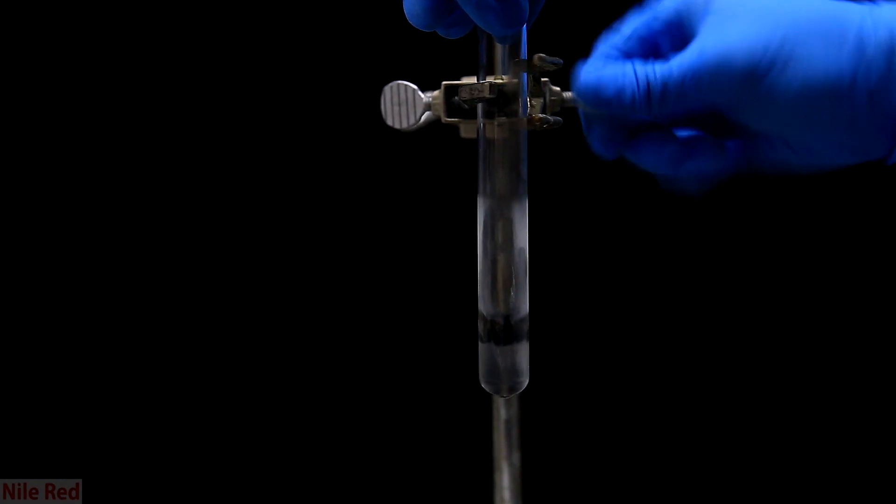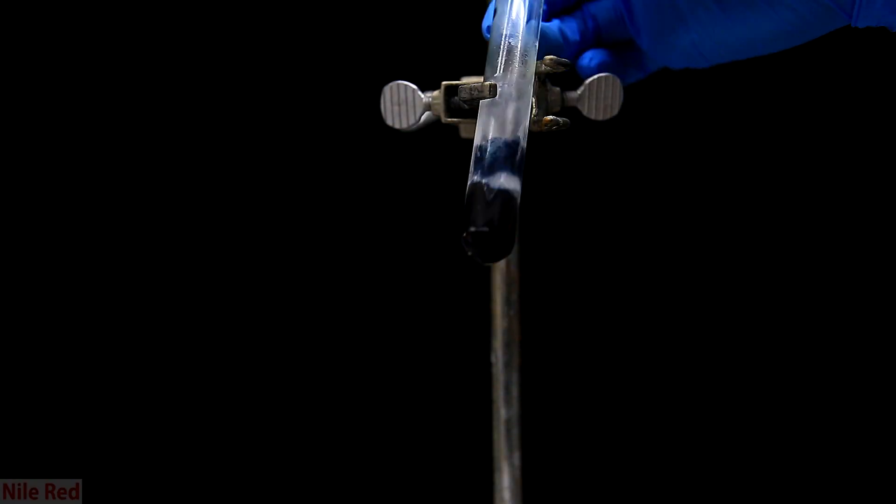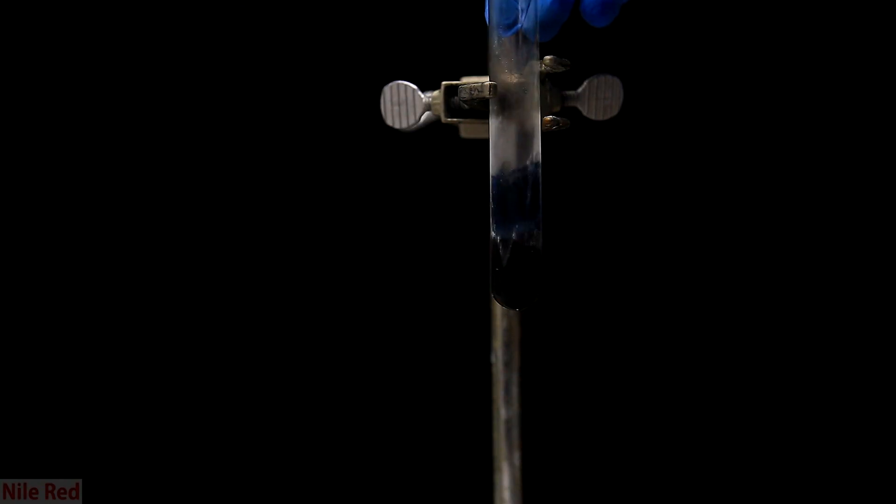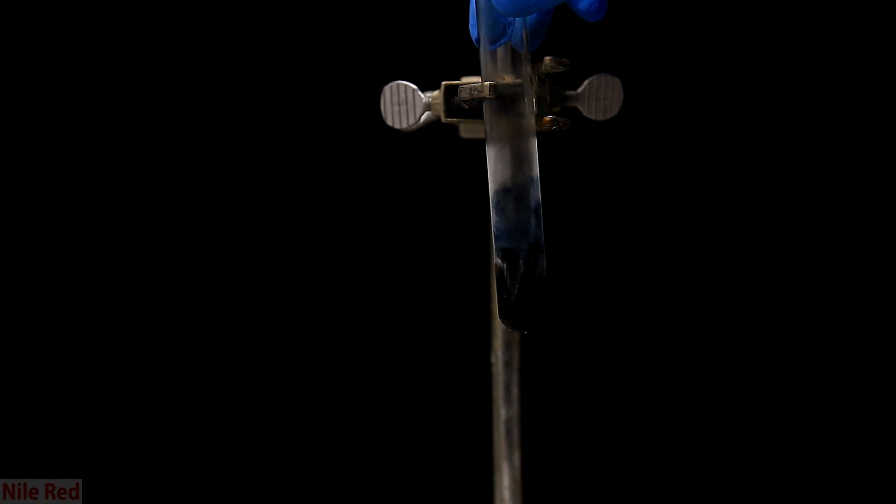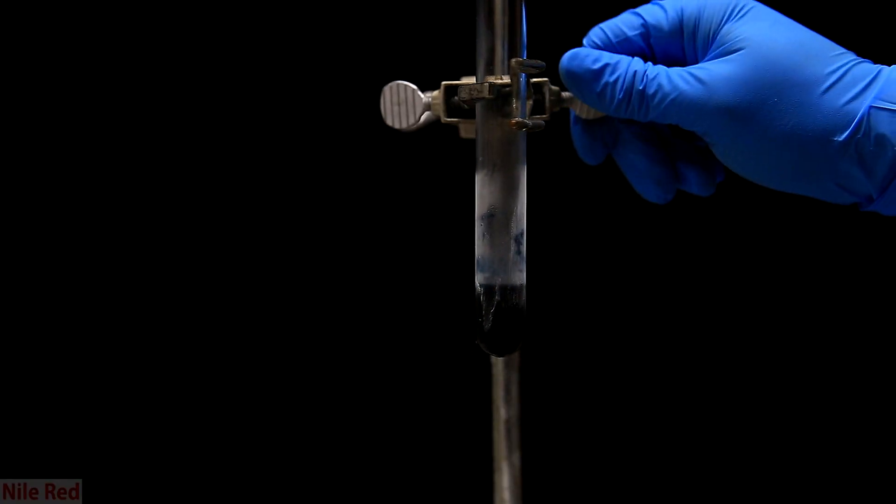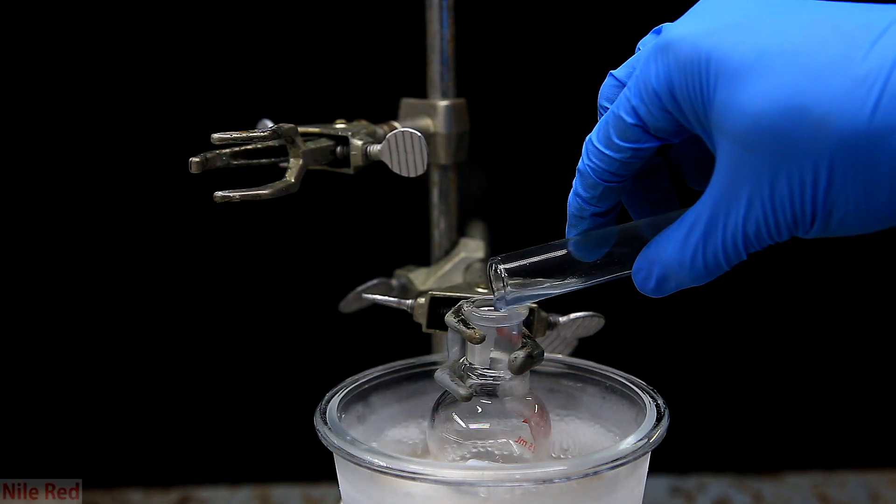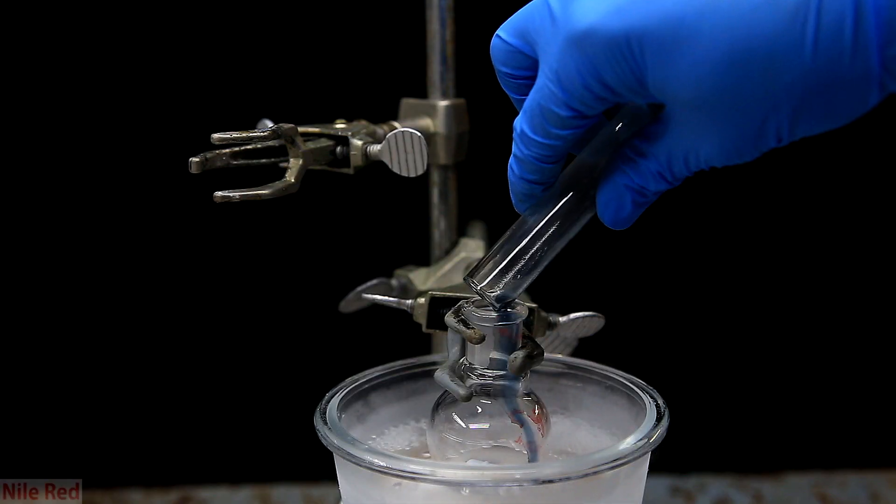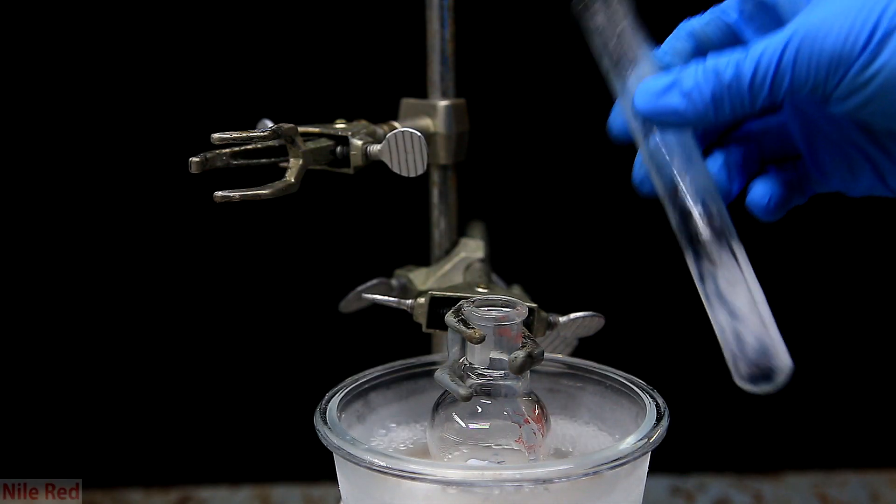Unfortunately, I didn't plan super well, and I used the black background instead of a white one. You can still see the blue color, but it's not as evident as it could have been. We can pour out the contents of the test tube, and we can see a nice blue liquid comes out. In the same flask, I added more liquid ammonia and more lithium, but unfortunately, I lost the footage somehow.